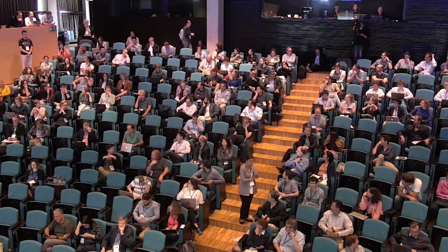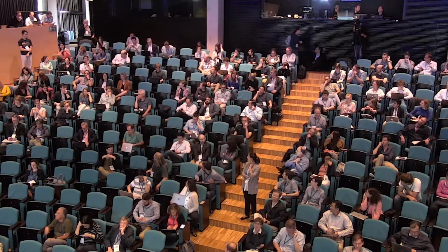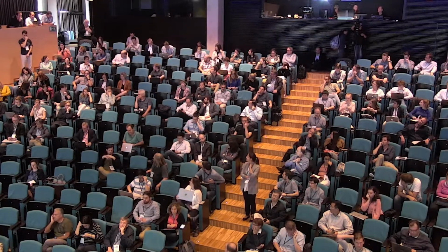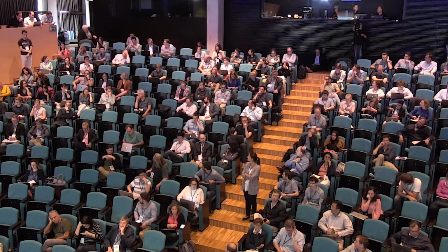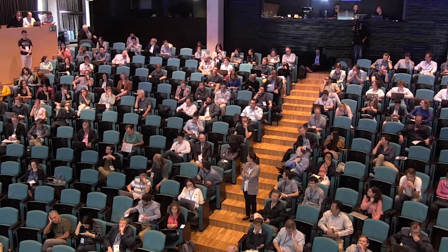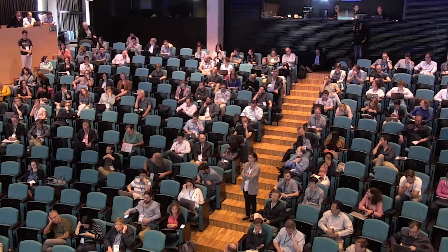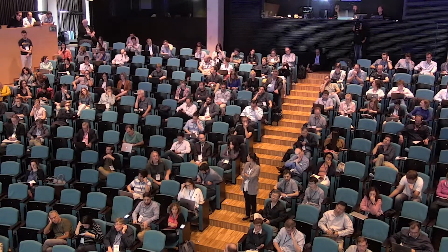Okay, thank you. So thanks for your talk. And so for the comparison of multiple slides, I think it would be critical to put all the slides in a comparable spatial frame to align the slides from different slides. So how did you do that, to align the different slides to a comparable location?